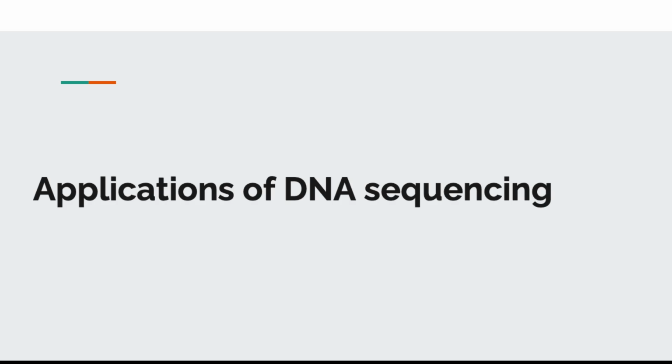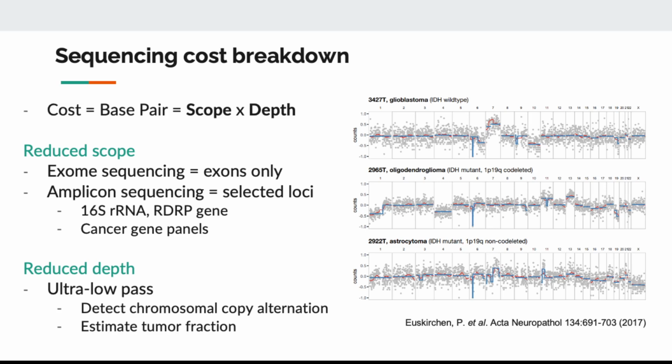Okay. So with DNA sequencing, we know that we can sequence DNA, but actually we can do more than just sequence DNA. So for the last section of today's lecture, we're going to talk about molecular assays that we can create with DNA sequencing. But first, I want you to consider that when we think about DNA sequencing, we can be flexible about the scope of sequencing and the depth of sequencing.